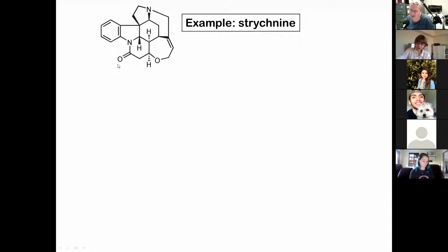I could have you vote on it, but I'll help you. On the benzene, we got 4, right? 1, 2, 3, 4. Any CHs over here? Not really, no CHs. These are CH2. Okay, so we have 4, this is 1, that's 5, 6. The alkene has 1, that's 7. And there's also 1 right there, we're not showing it, but it's there, that's 8. Any more? I think there's 1 right there, that's 9. So there should be 9 CHs, right?